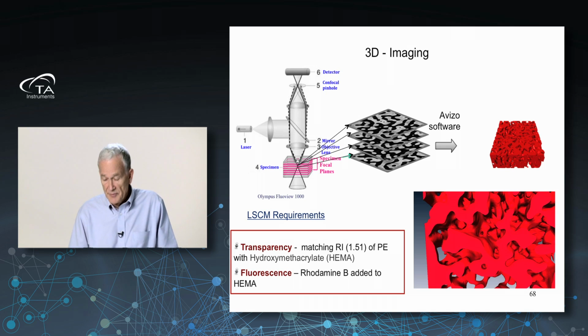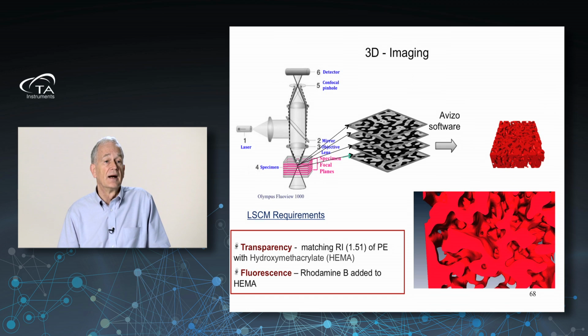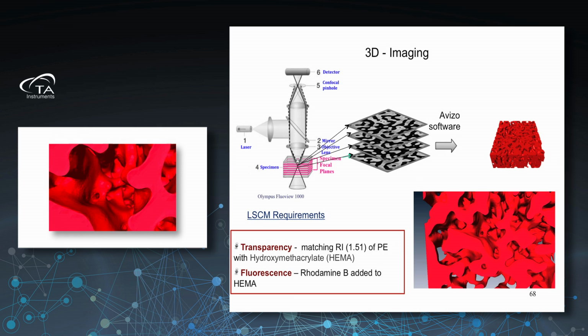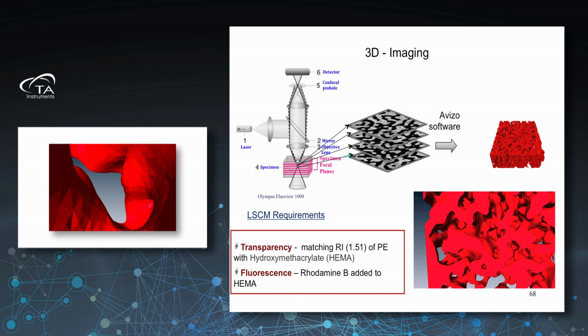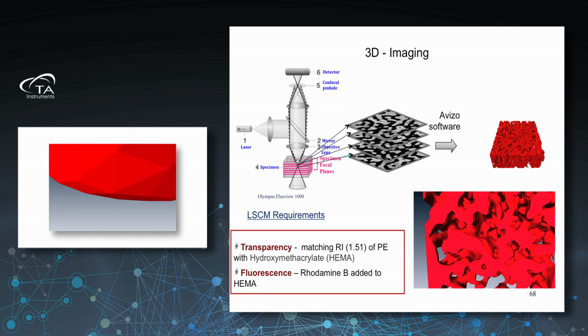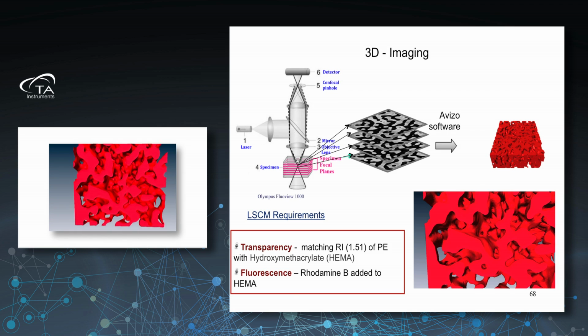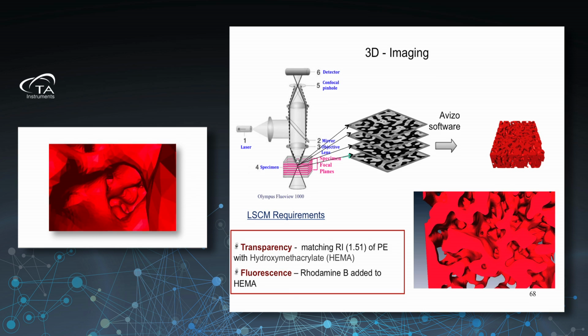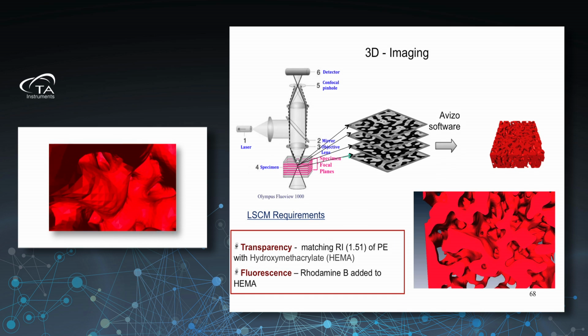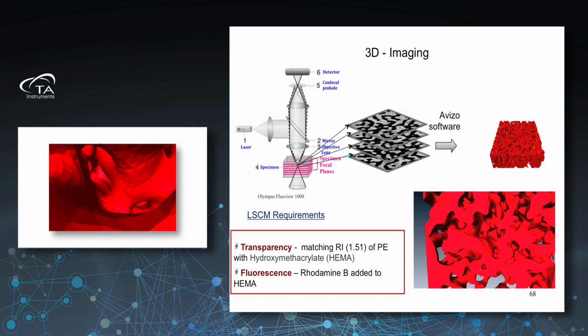And we've characterized this with microscopy as well as with a laser confocal microscope. And here is a video that's been constructed out of about 100 Z-scans through our cocontinuous sample. And you can see you're moving through the image. You can see it's been made up of little triangular elements that were taken from the confocal microscope. And you can see the pores that are in our sample. And those pores are going to be valuable as, for example, a battery separator or forming a membrane.